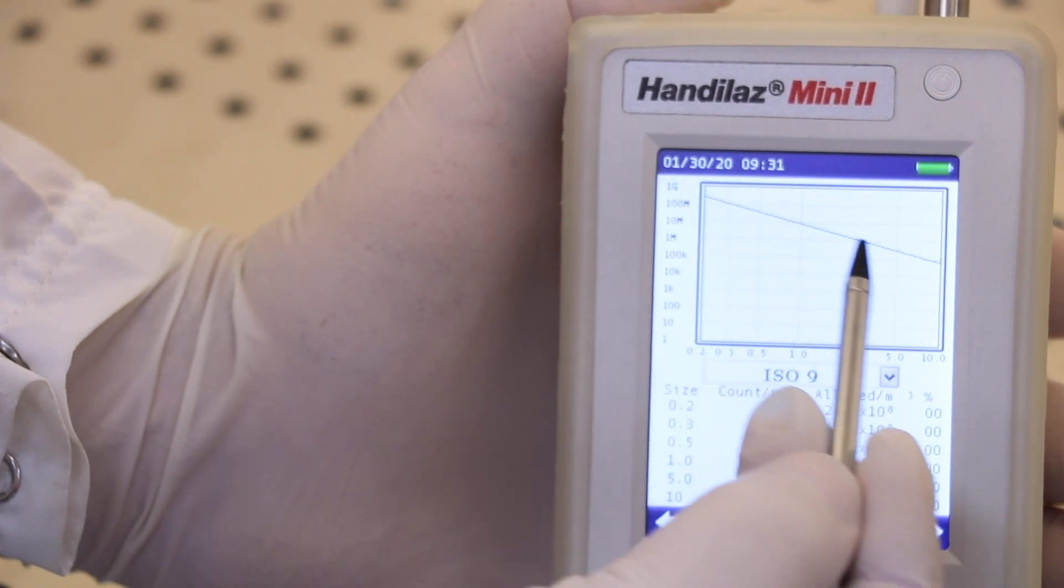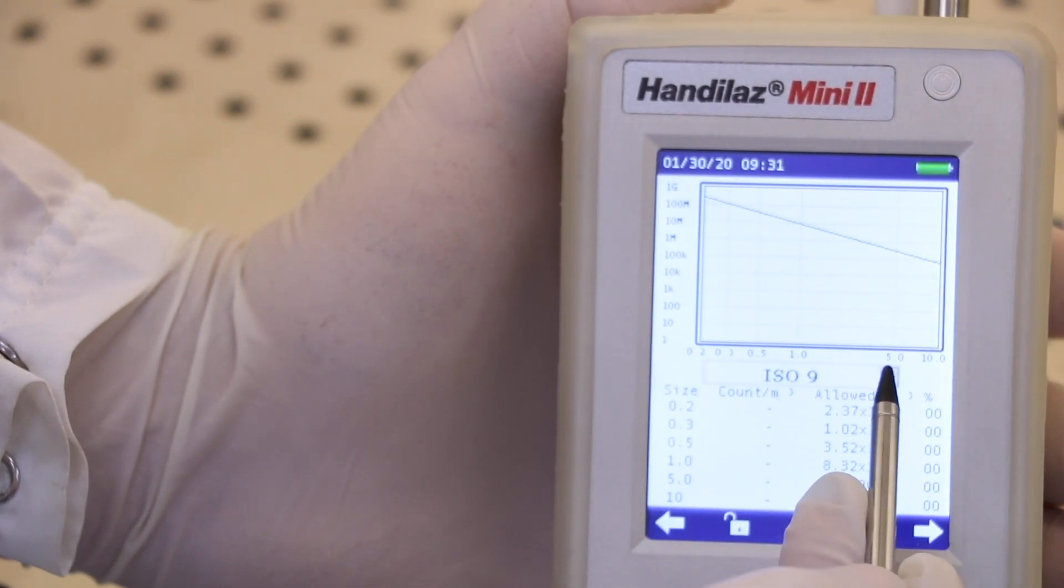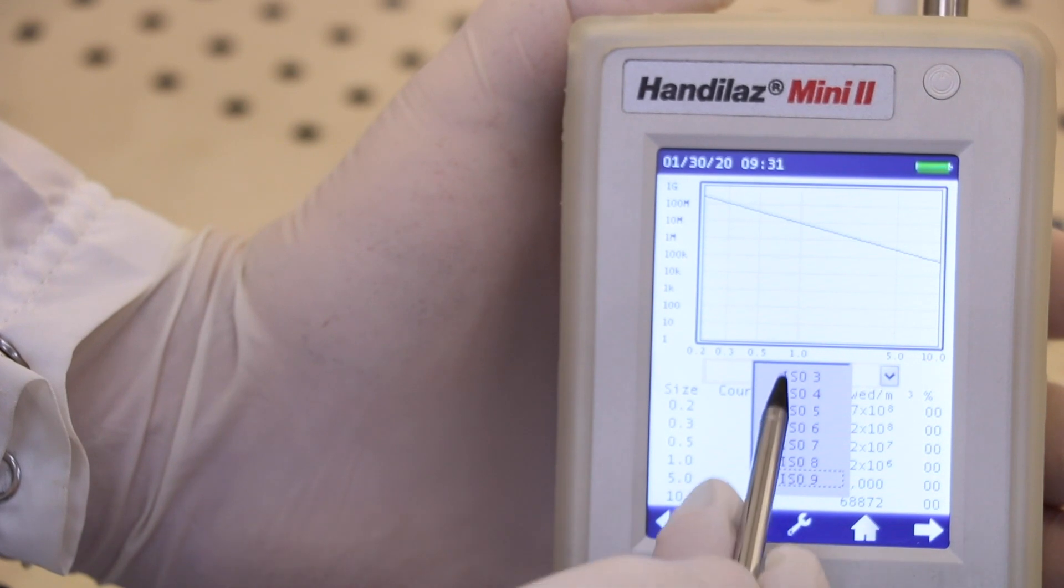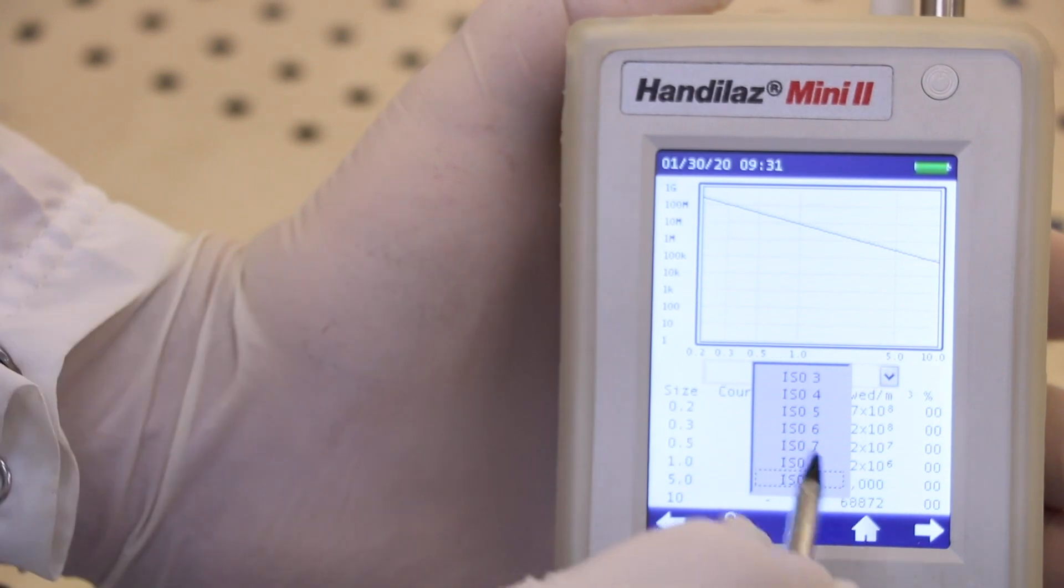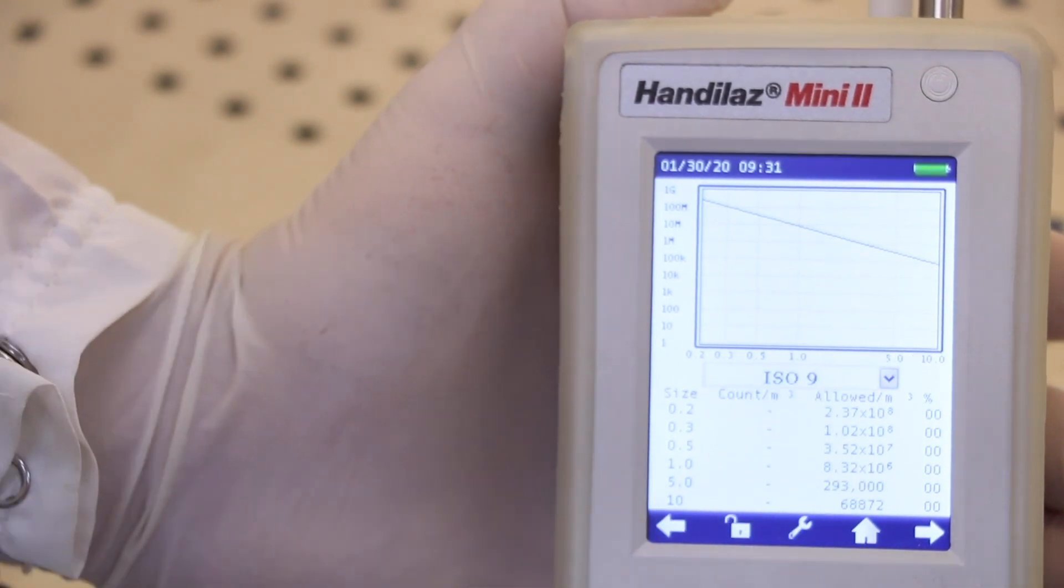The black line indicates the threshold for meeting the spec. You can change this level by simply selecting the ISO class from the pull-down menu. So let's see where we end up, starting the cycle as the unit auto-calibrates for flow.